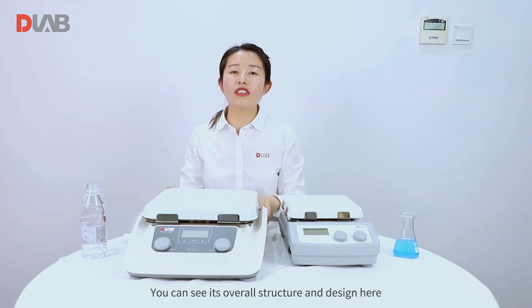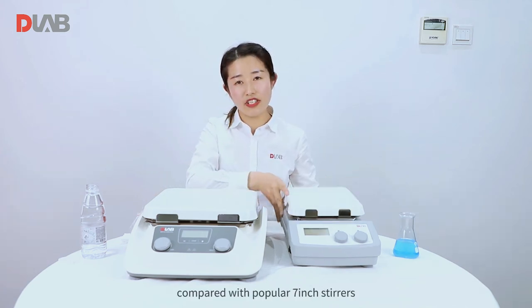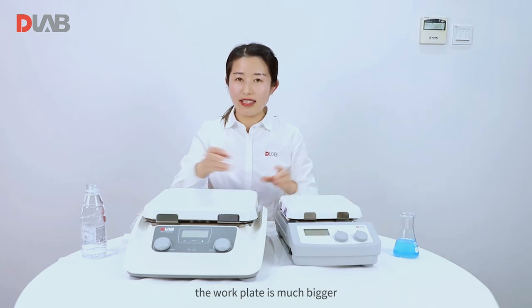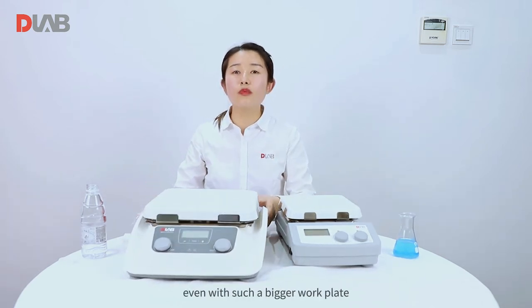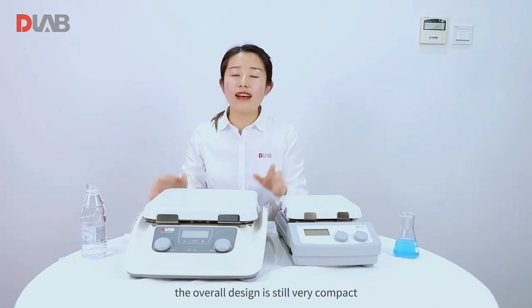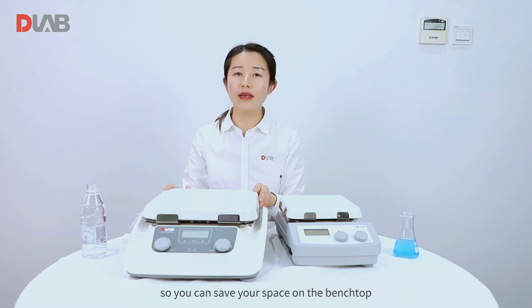You can see the overall structure and design here. Compared with the popular 7-inch stirrer, the work plate is much bigger. Even with such a bigger work plate, the overall design is still very compact, so you can save your space on the bench top.